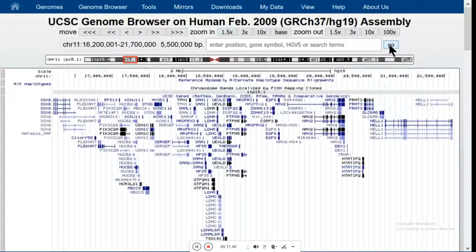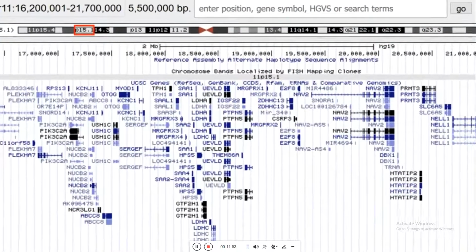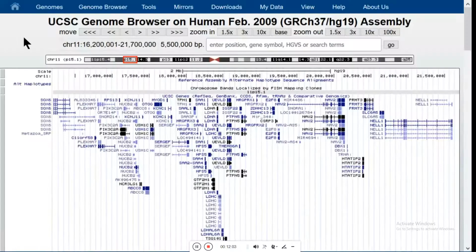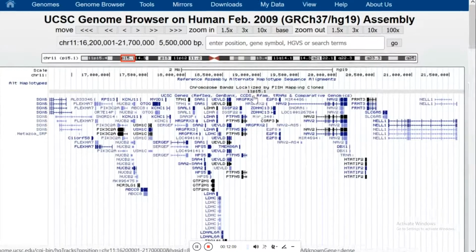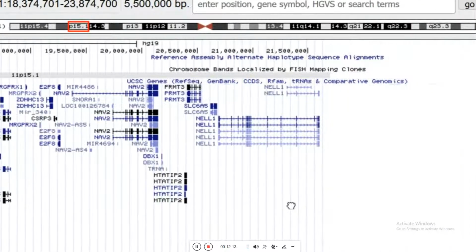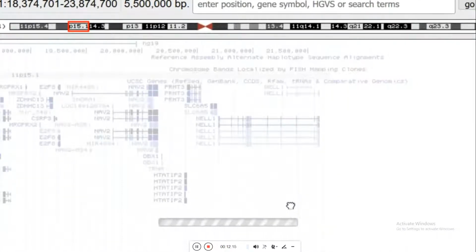and you'll see that we are highlighting in red in the chromosome ideogram the region of that cytological band. Cytoband nomenclature is useful when navigating on the human, mouse, and Drosophila genomes, all of which have well-established cytology. You'll notice that the chromosome band track came on, and so 11P15.1 is shown here.